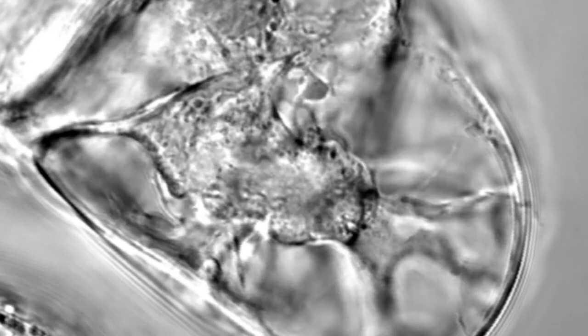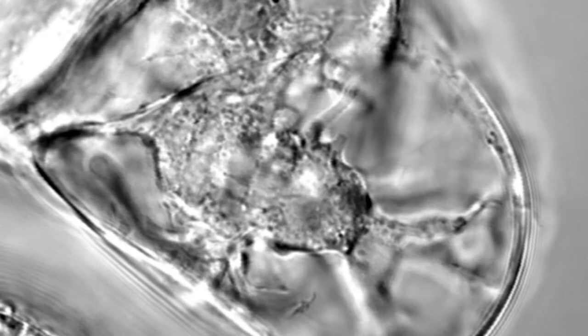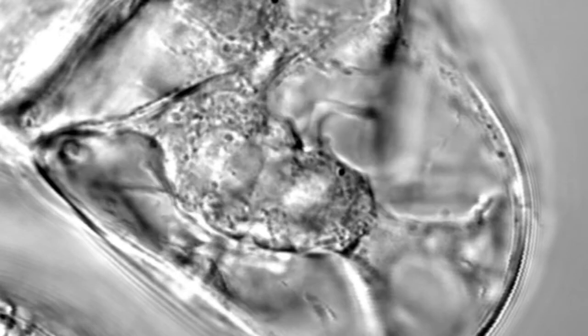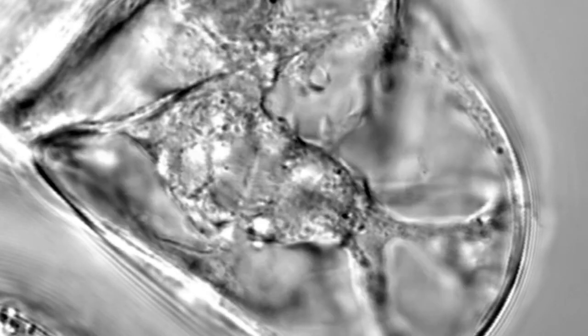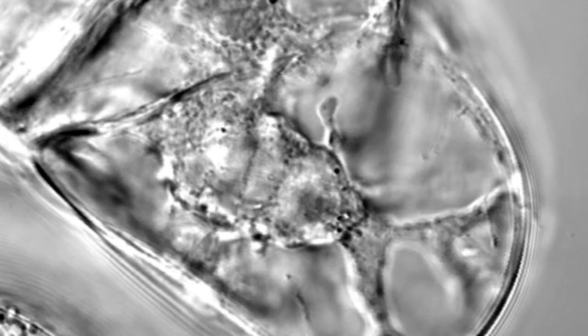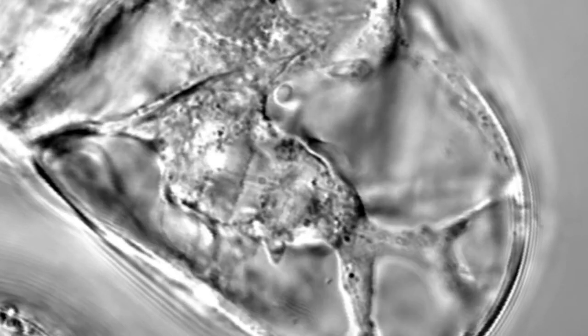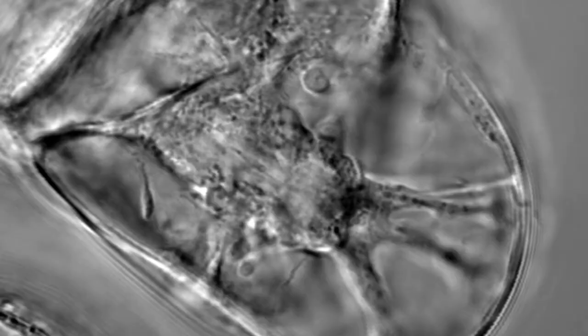Finally, we have a video taken by Rigoberto Ramirez and Ernie Kwok of tobacco cells undergoing mitosis. The microscope is using only transmission light with differential interference contrast.